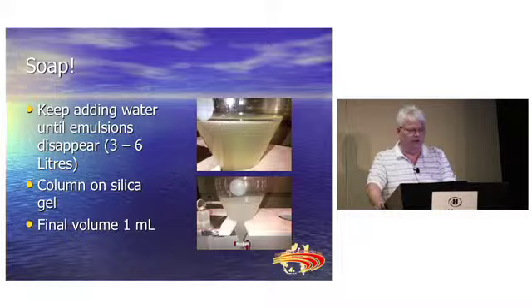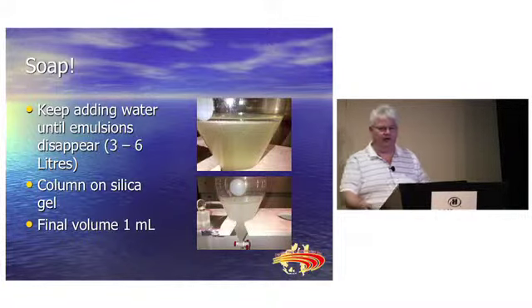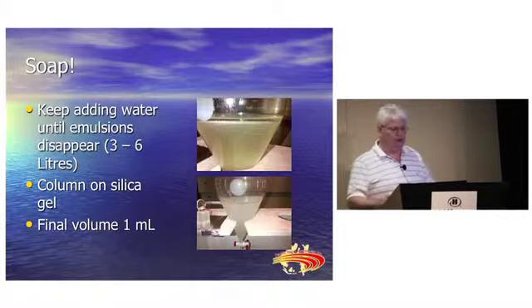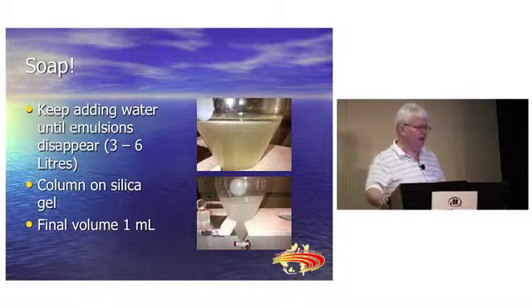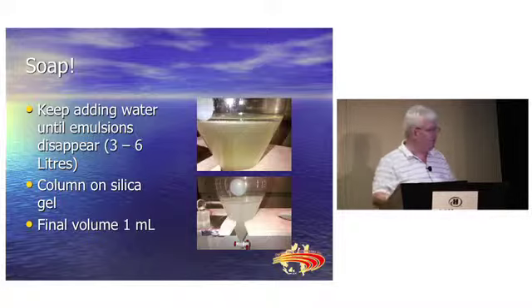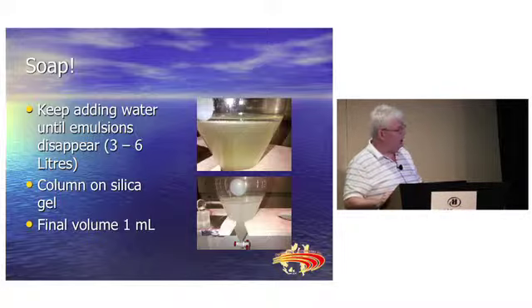The other thing, when you cook fish or you cook meat and you add base and you add water, what do you create but soap? It's a basic formula for soap. And when you try and back extract that, you take that methanol, put it in water, you shake it up, and I tried to get a nice big emulsion when I had the lab do it. The samples we took wouldn't emulsify too much, but you can see a very fine layer in there on top of the water.